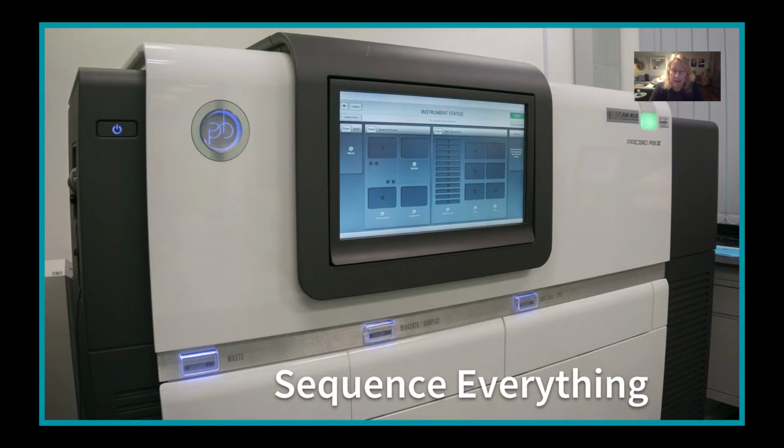So at the heart of it is the data gathering process, which happens in the lab, of course, because the samples, whether they're coming from humans or animals or something else, they're DNA and RNA samples, and they're processed on these very large machines.